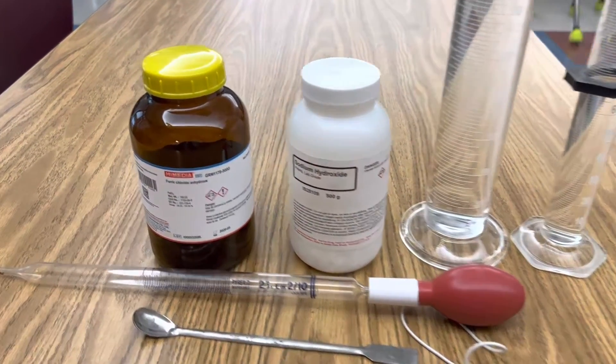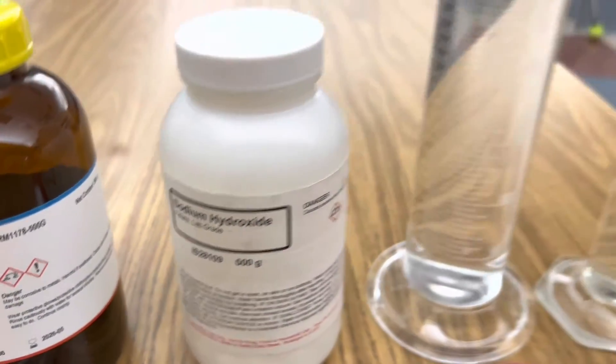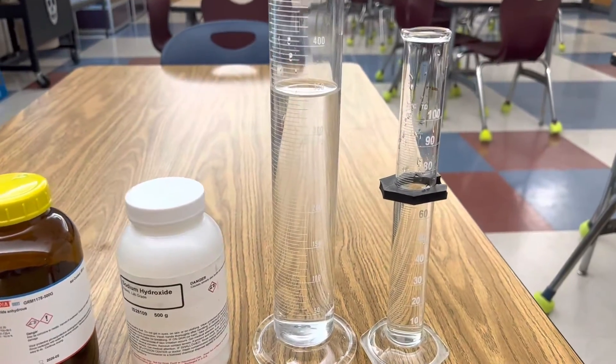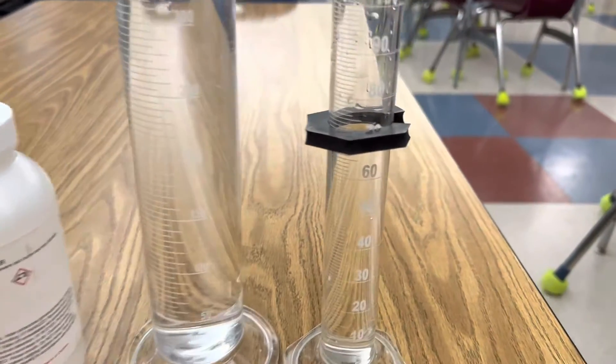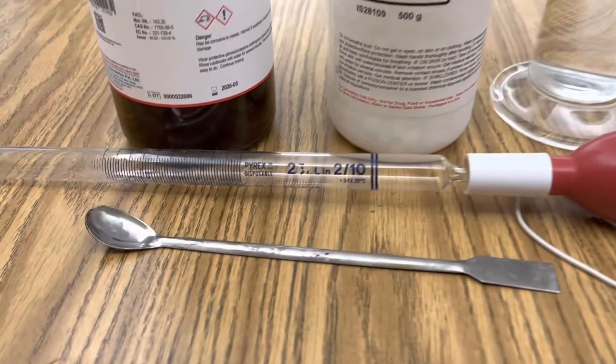All I'm using in this investigation is ferric chloride, sodium hydroxide, one graduated cylinder with 350 milliliters of distilled water, a second graduated cylinder with 70 milliliters of water, my dropper, and a spoon.